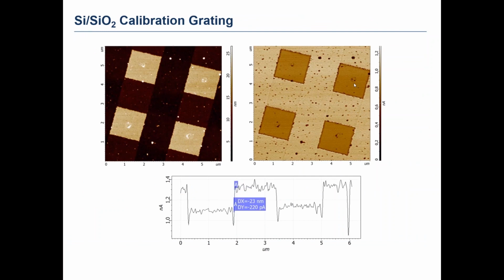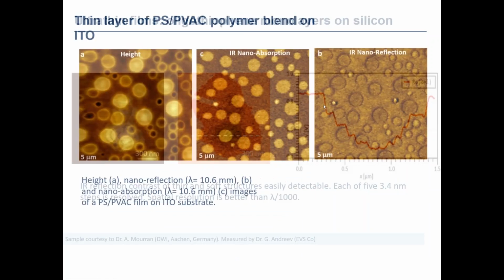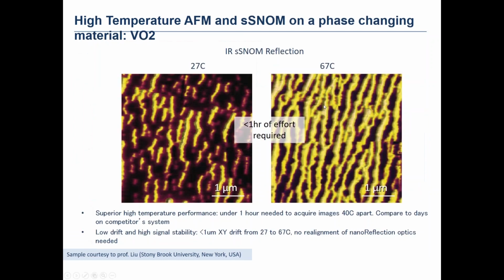Yes, thanks for this question. This is a good question. I'm not sure what slide you mean, but probably this one. Actually, the minimization of the thermal drift is one of the very important issues in atomic force microscopy, and its different applications and combinations with the optical techniques.